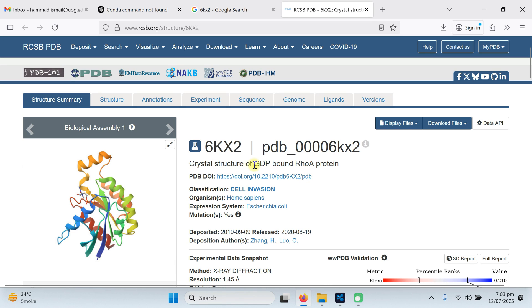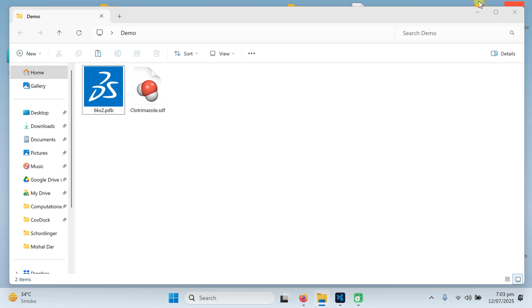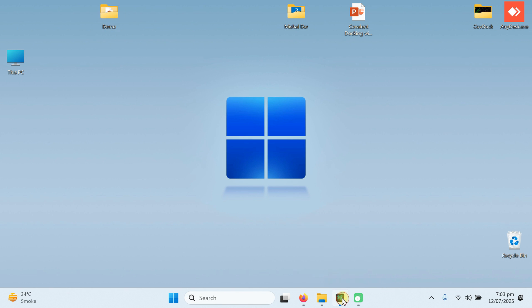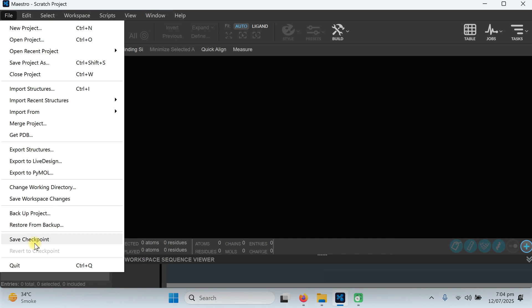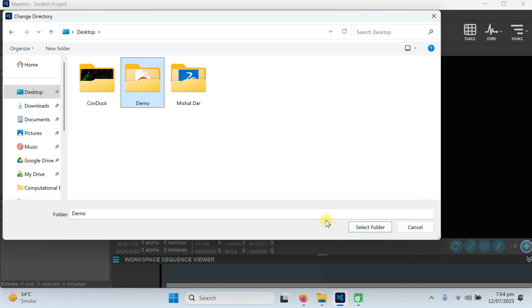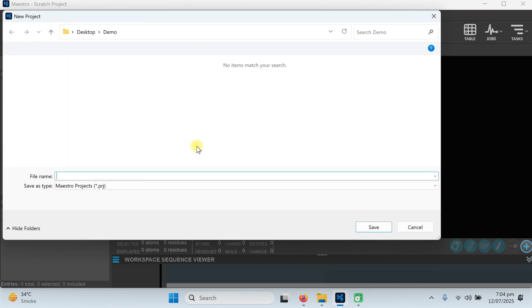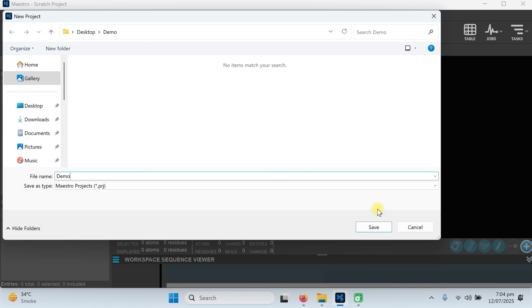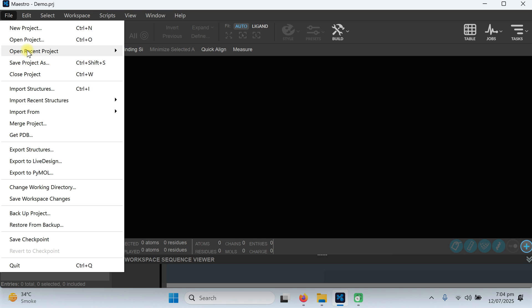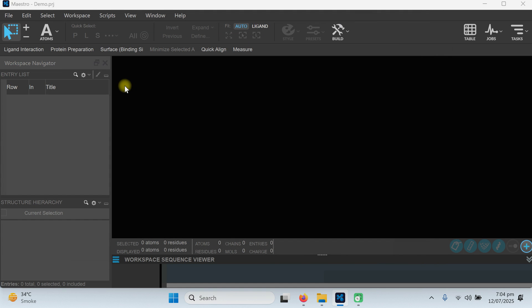For this tutorial we have selected a crystal structure of GDP bound with the RhoA protein. We have downloaded the protein with name 6KX2 and our ligand is clotrimazole. First of all we have created a folder named 'demo' on our desktop. Now open the Maestro program, go to File, change the working directory to the desktop and select the demo folder. Then go to File again, create a new project named 'demo' and save it, then import the structures — one is our protein and the other is our ligand.